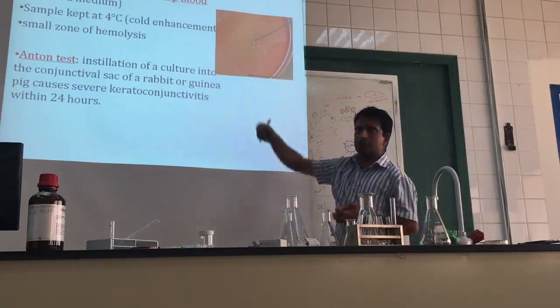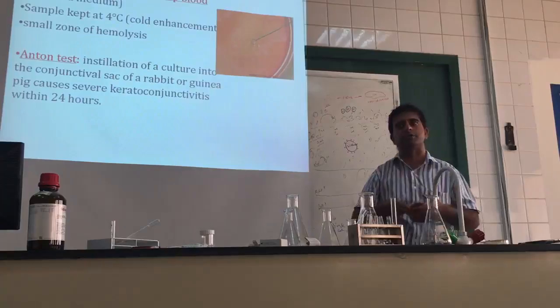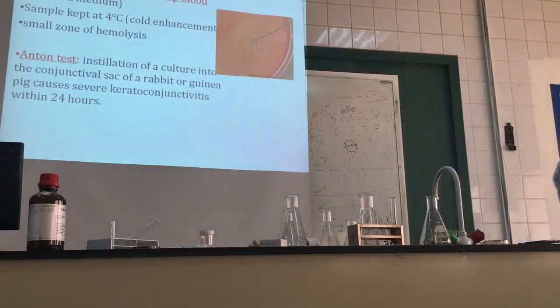Small zone of hemolysis behind the colony. You have to remove the colony, then you can see the hemolysis. Not complete, okay? Not complete hemolysis, but hemolysis is there for Listeria.